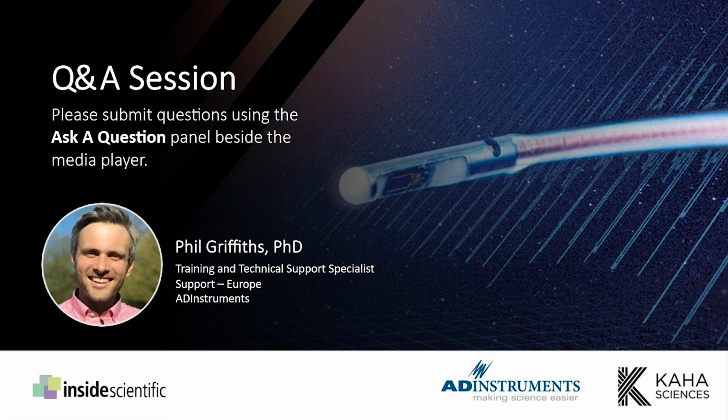So the telemeters constantly measure the temperature within the animal to make sure that they don't overheat. And if for any reason they are warming up, then they are able to disable the wireless power field as well. So there's a lot of built-in fail-safes to make sure that doesn't happen.